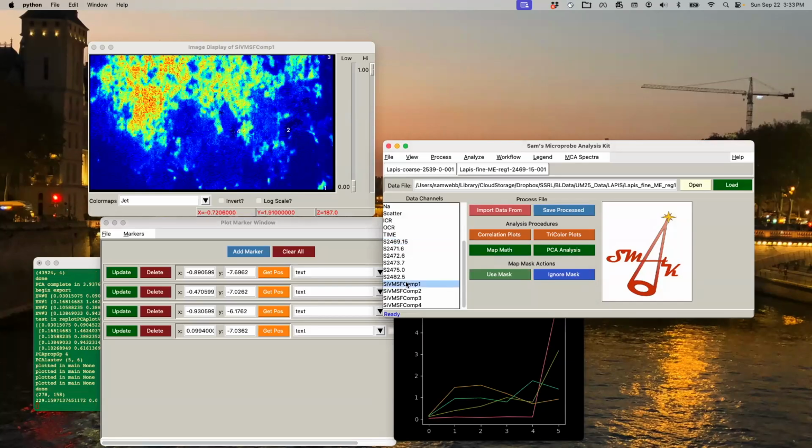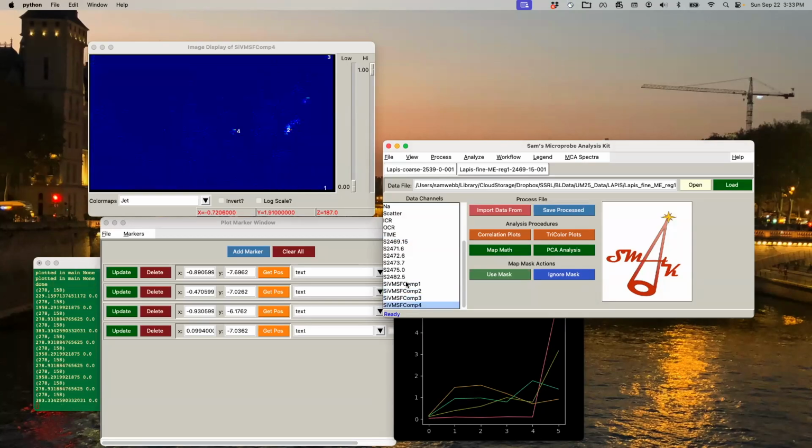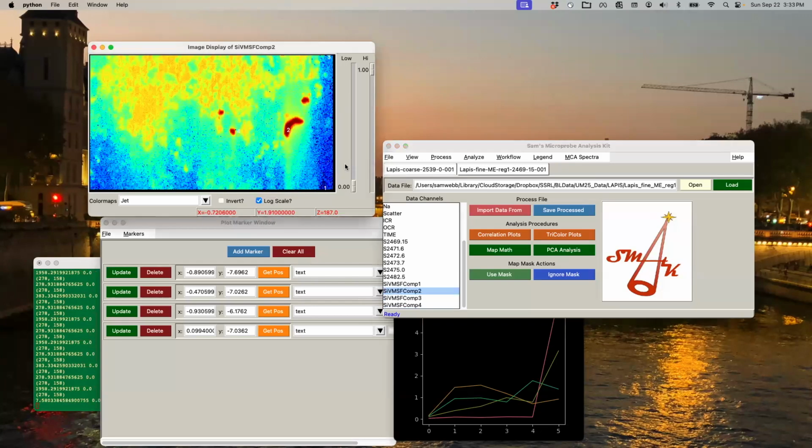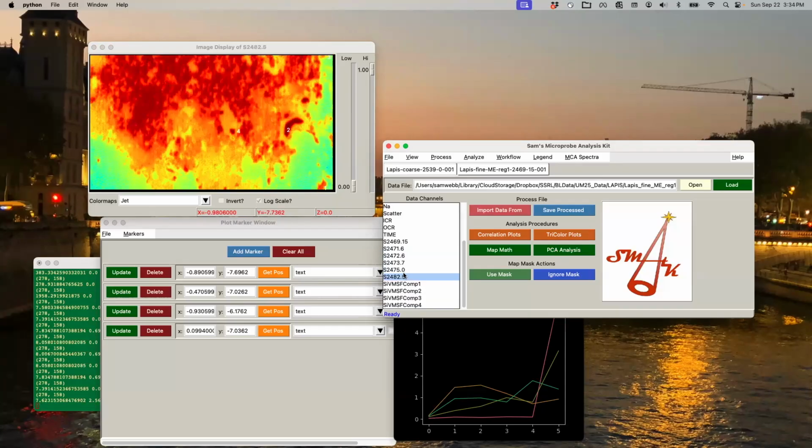Let's see how these look. So there's our sulfate area. There's our pyrites. That's version 1, version 2. Yeah, it's okay. We can actually go with this. I'm actually okay with this. What I'm convinced about here is that it doesn't look too bad. I was worried about these 1 and 3 points being so far off to the corner that maybe we either didn't make our threshold of noise high enough, or that we had a feathering of incomplete lines on the outside. It looks like I don't need to worry about that. We could have tried to make it go higher concentration. Let's try that one more time.